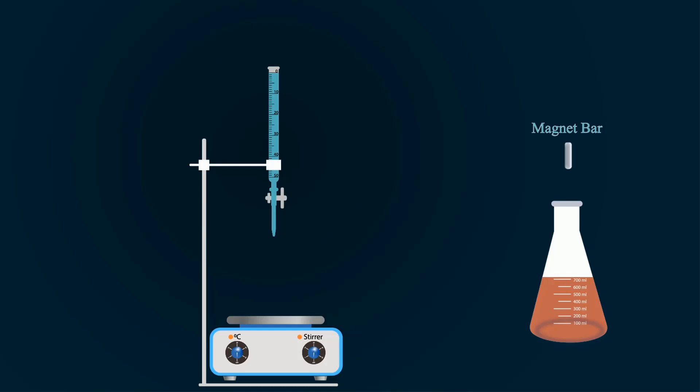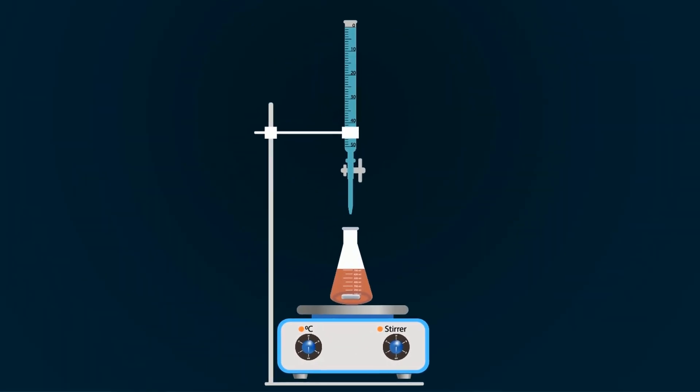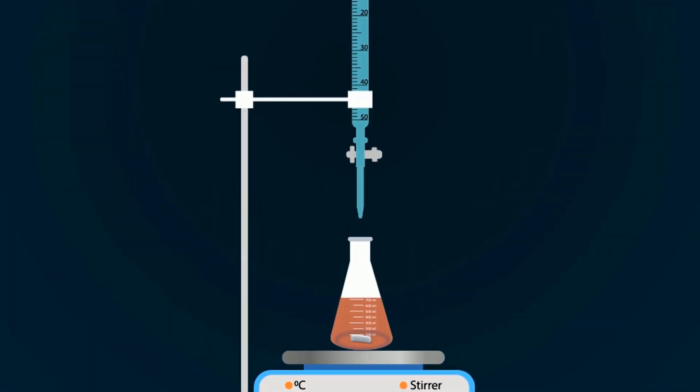Add magnet bar into the conical flask for continuous mixing and place the flask onto the magnetic stirrer. Now start titration. For this, you will have to loosen the loop so that it will come into the solution drop by drop. Add EDTA solution until the solution color turns into bluish purple.